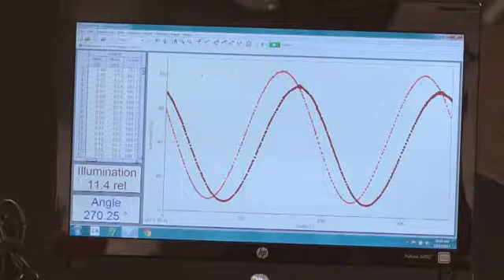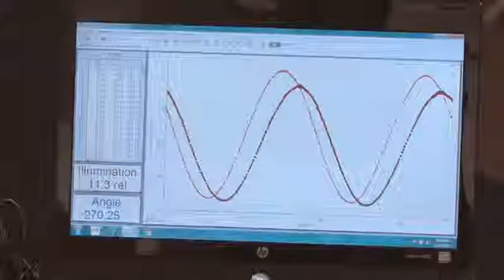This data can be analyzed quantitatively several different ways in Logger Pro. The quickest and simplest way to quantitatively analyze these results is to use the statistics feature.